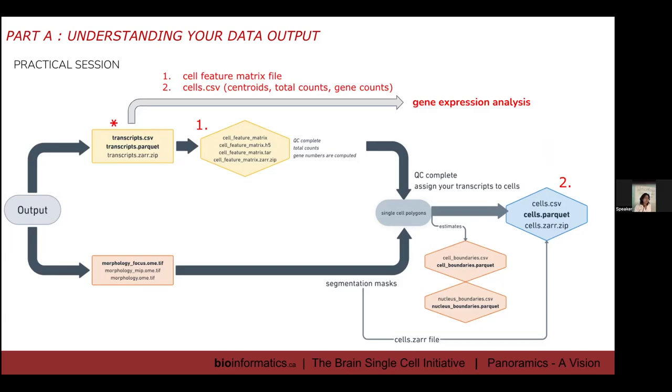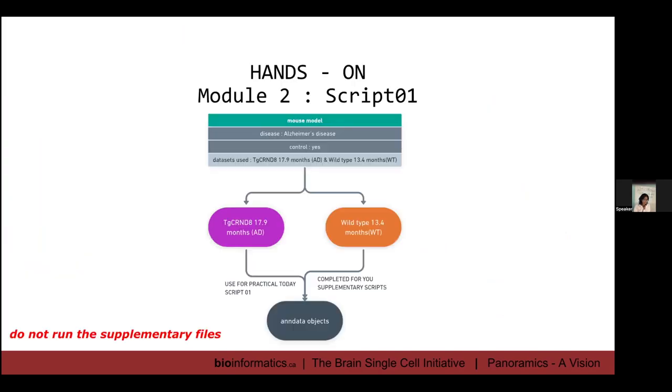We're going to start with the transcripts.csv or transcripts.parquet file, and you're going to derive your cell feature matrix file, your centroid, total counts, and gene counts. You're going to form your AnnData object from there. The reason for doing that is I would like you to take a look at what the transcripts files are about and how they are manipulated, so you have a better understanding.